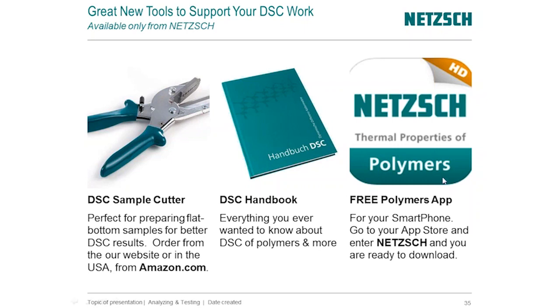And then finally, maybe one of the most useful tools that you'll ever see available is an app for your smartphone. And this tells you all the thermal properties of about 80 different polymers, things like glass transition, curing, melting point, crystallinity, so on. It's just got a wealth of information built into this library that also allows you to search on properties to pick the right polymers. So if you're looking for a polymer with a glass transition of around 30 degrees C, for example, you can input that into this app and it'll identify which polymers closest fit your application.